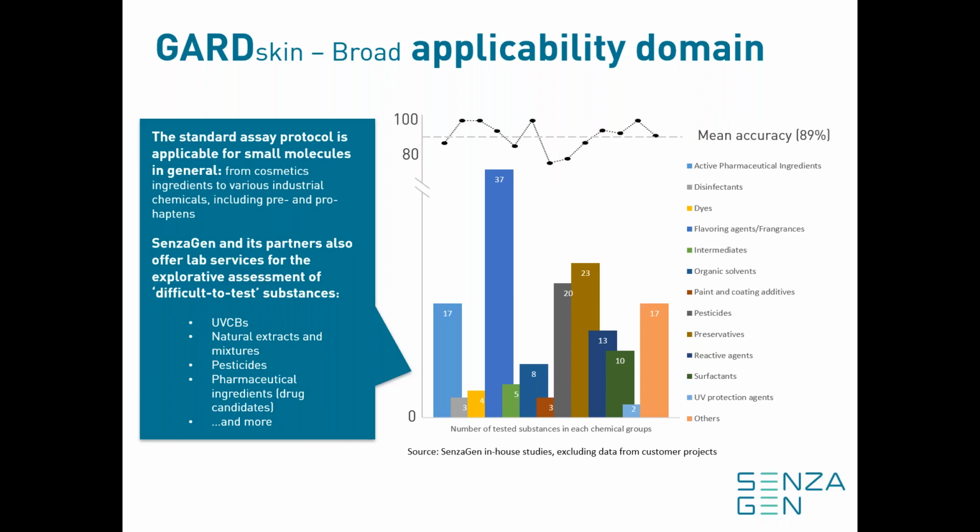So what I would like to also describe more in the different cases that I will soon start to go into is the testing of more complex samples such as UVCBs and natural extracts and mixtures, for example.